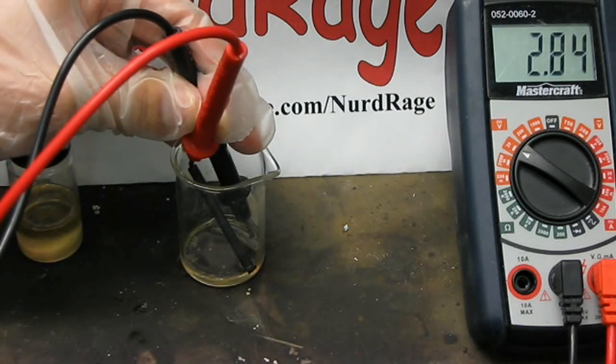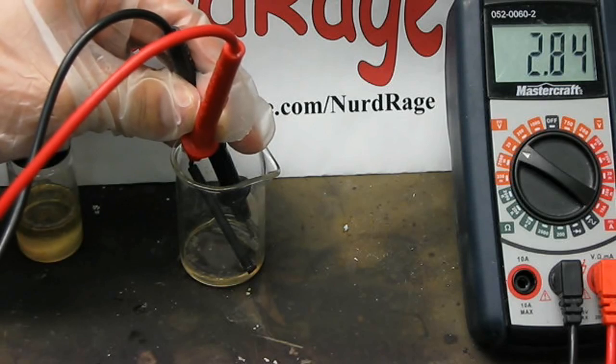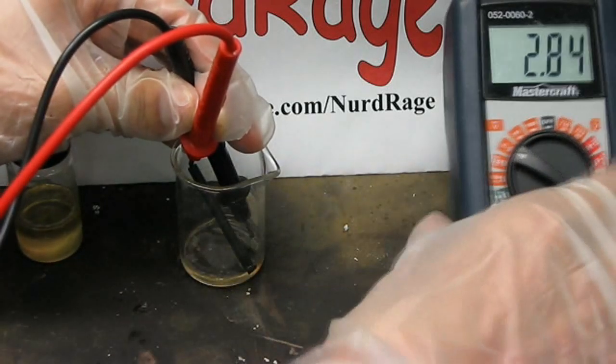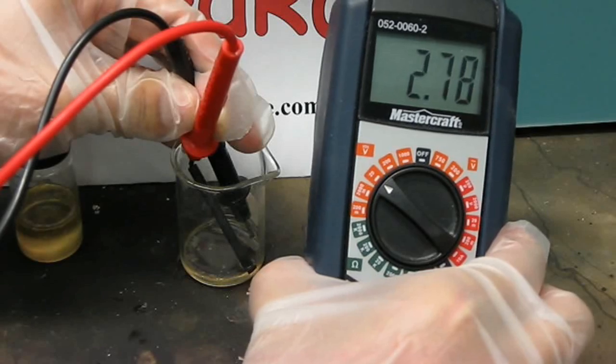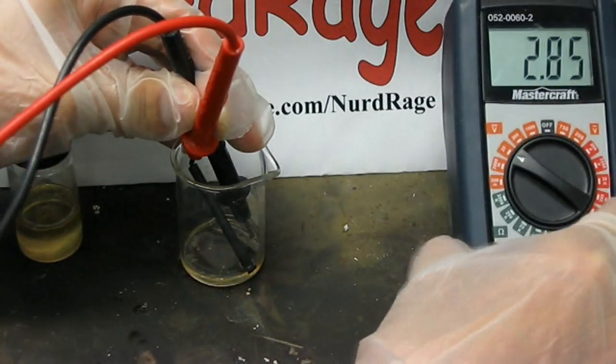And it looks like the voltage is around 2.8 volts. It's not very stable and should be closer to 3.5 volts. But this solution of theonyl chloride is very impure, resulting in these poor readings.